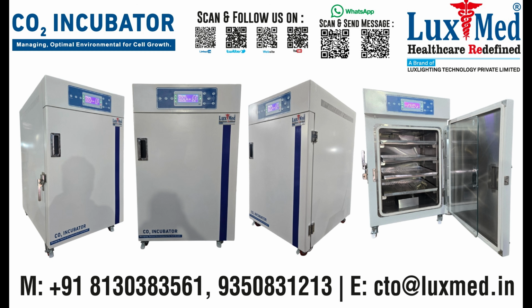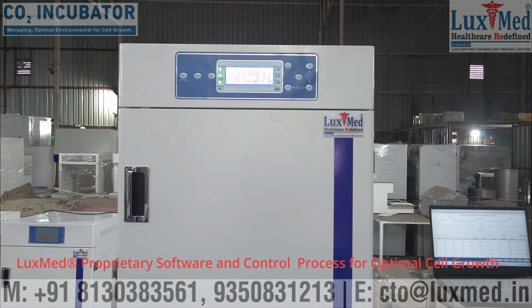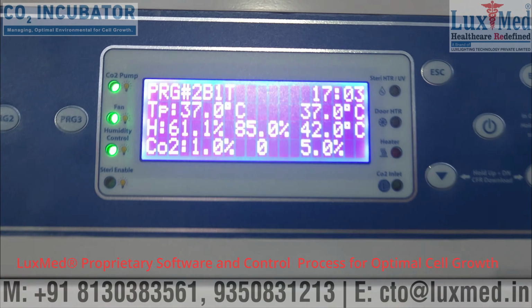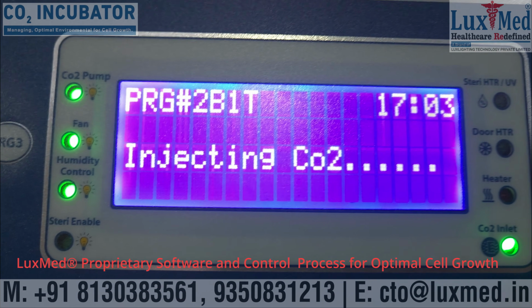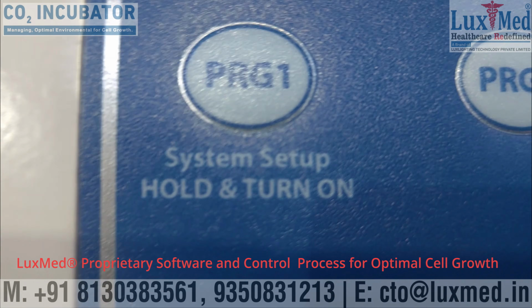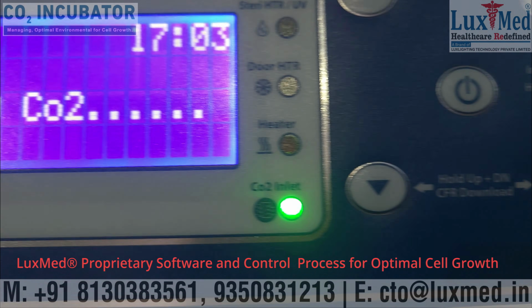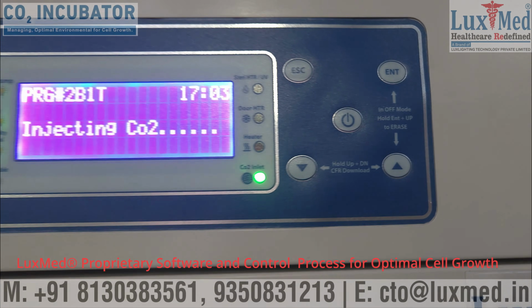LuxMed CO₂ incubators are essential laboratory equipment used to maintain optimal conditions for cell and tissue cultures. They provide a controlled environment with specific temperature, humidity, and CO₂ levels to promote cell growth and survival. These incubators are crucial in various applications, including cell-based research, drug discovery, and even in vitro fertilization.